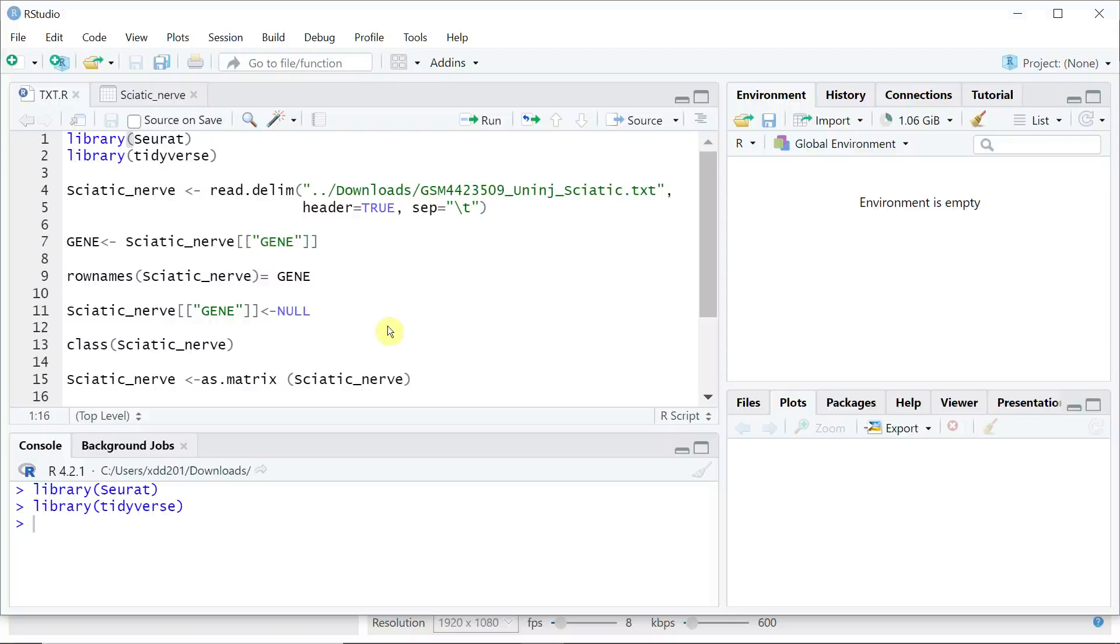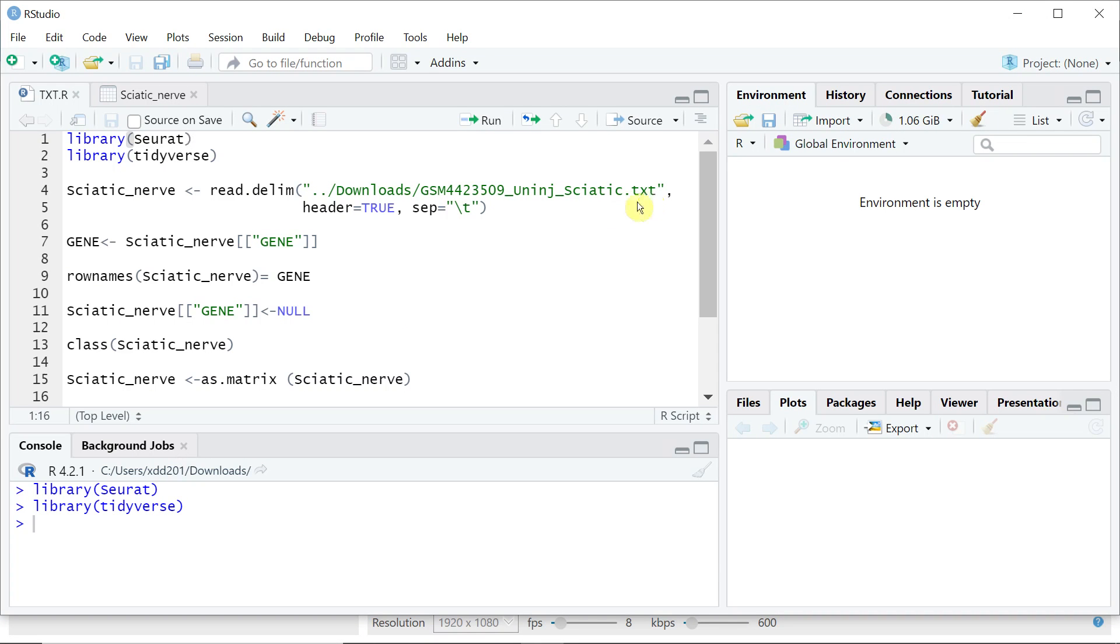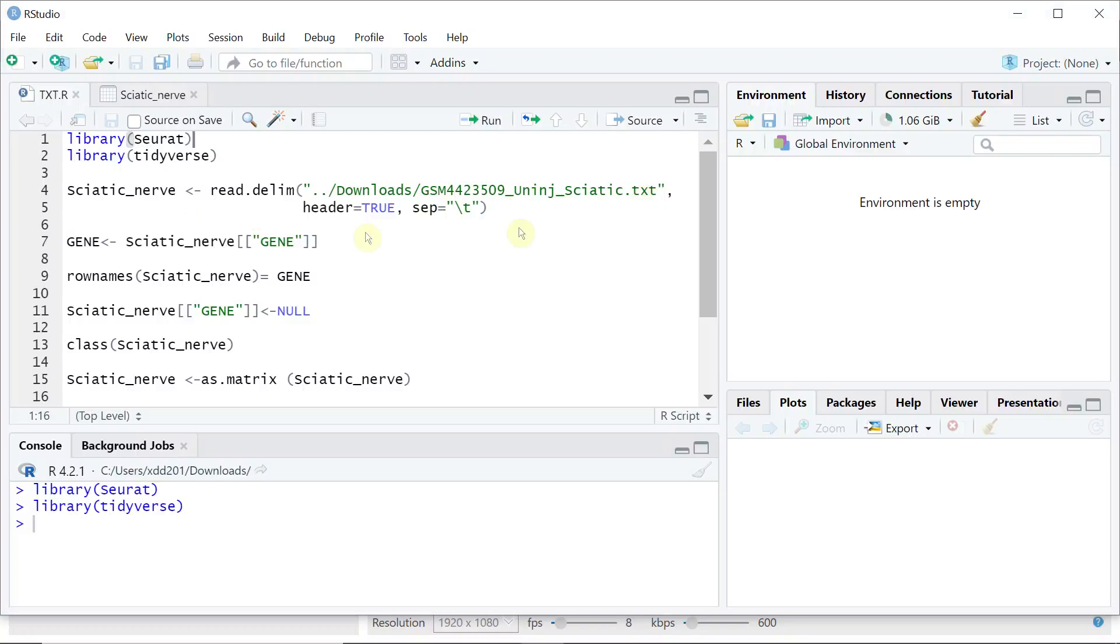Hello everyone. Welcome back to my short video tutorials. Today I'm going to show you how to load text file single cell RNA sequencing data into R.